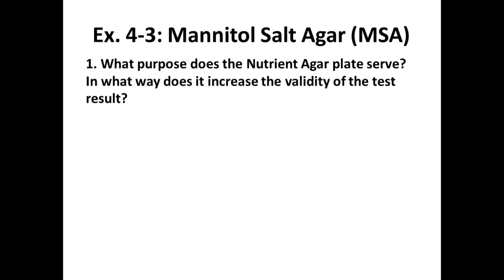Yes, it's definitely salt tolerant. You definitely have growth. Yours might be salt tolerant, and do you notice your plate is kind of that bright pink like your phenol red tubes? That's because there's protein in this. So again, yours is probably digesting the protein. That's why it's getting pinker. No, not mannitol, protein. Right, doesn't ferment. Non-fermenter. All right.